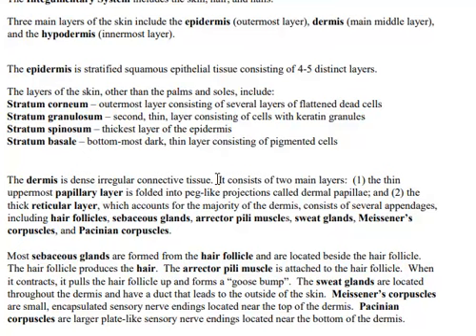you're going to find your hair follicles, your sebaceous glands, which are going to secrete oil, your erector pili muscles, your sweat glands, and your Meissner's corpuscles and your Pacinian corpuscles. So the Meissner's corpuscles are closer to the surface of the dermis, to the top of the dermis, and they're a sensory nerve ending, and the Pacinian corpuscle is one that's deeper down, and we're going to find it kind of looks to me almost like you've sliced an onion. It has those rings like a sliced onion would have. So if it's deep down and looks like a sliced onion, you got your Pacinian corpuscle.